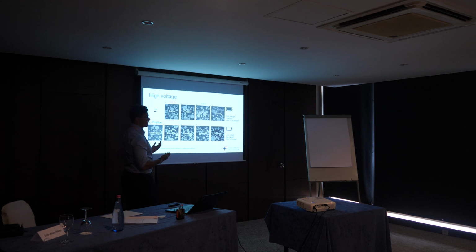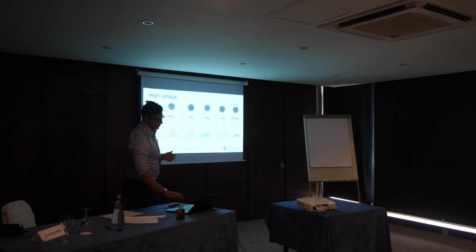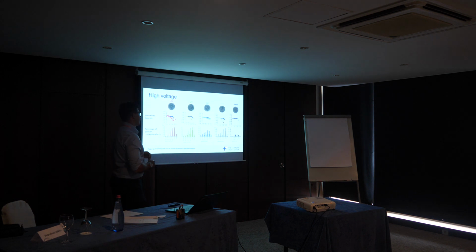And as you can see, hopefully you can see, there are cracks in all the particles along the top, and then when you put the lithium back in, these cracks close up. But again, these images take a long time. So the algorithm we've used has helped us quantify this and see this on a much larger scale.